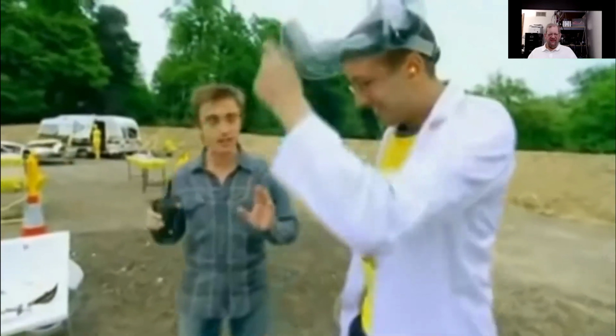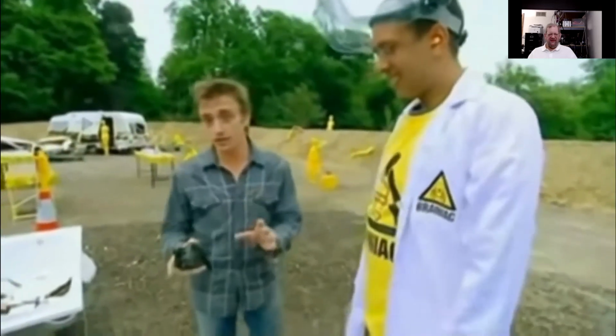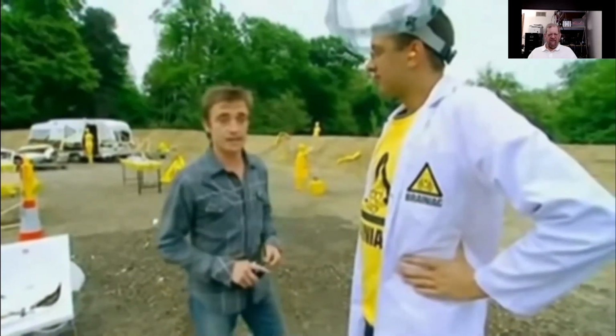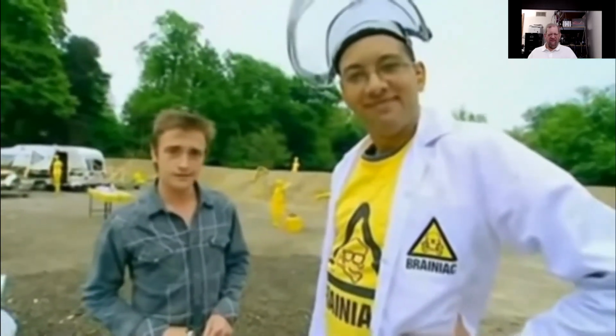Magnificent. And I think that concludes today's experiment. There is, I should say, one more, even more reactive metal, francium. But for some reason, they wouldn't let us have any of that. So there you go. Today's lesson. Never mix alkali metals with water.